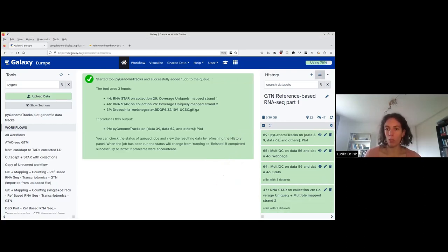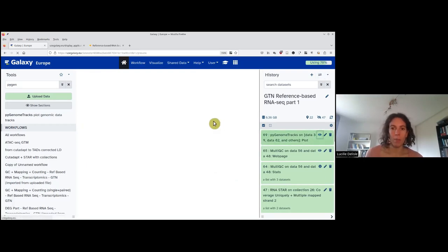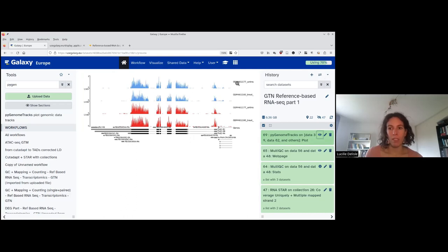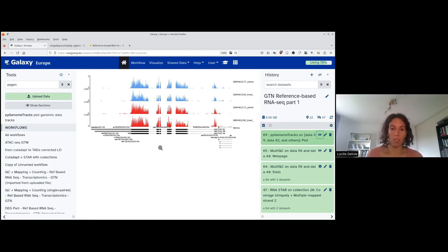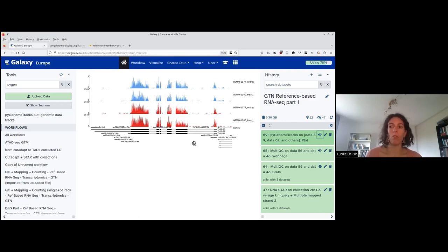The advantage of using the STAR coverage output is that STAR automatically accounts for paired-end data and flips the secondary read to give coverage matching what was actually sequenced. PyGenomeTracks has finished. Checking the result, I can see that for both the untreated and treated samples, the strand 1 coverage maximum is about 2, and the strand 2 coverage is also about 2. This means we have equal coverage on forward and reverse orientations — confirming this is an unstranded library. We can also verify there is no coverage in the intron regions.